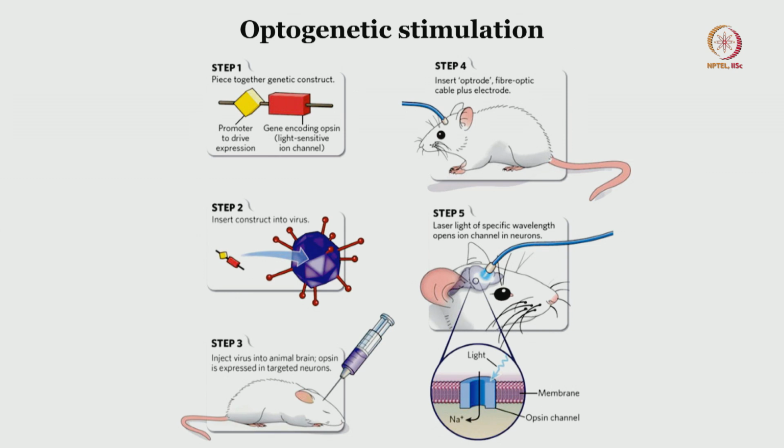So then what I am trying to cover is the simple surgical procedure that is required to achieve a good experimental outcome. So here are the steps, which briefly tell you the major steps involved in order to create an optogenetic stimulation model.